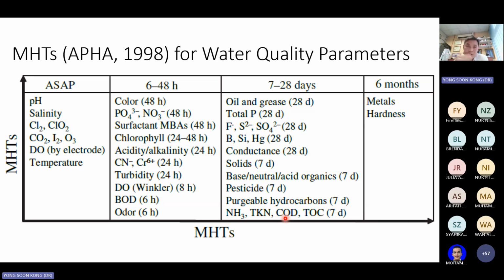Okay, now don't trust me. Why not? After this, you double check with Dr. Nick and you ask her for COD, you need to preserve or not. So if you need to put preservative, is it really sulfuric acid? I know for sure ammonia is sulfuric acid, but COD I'm not sure. You double check for me. Okay, so water group, don't forget, do you want to put sulfuric acid as your preservative?